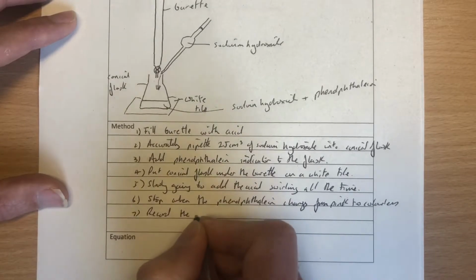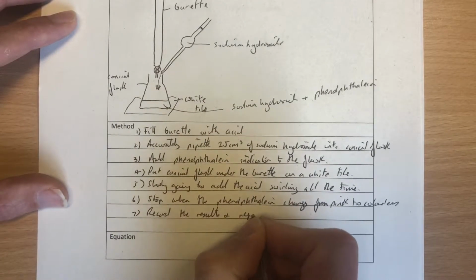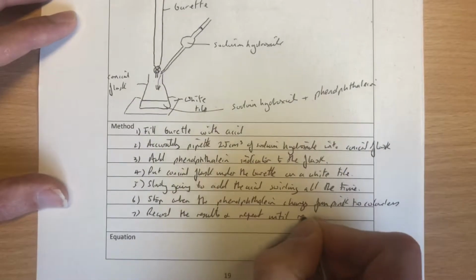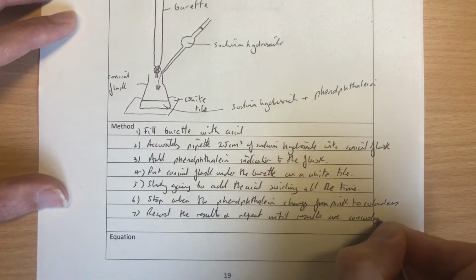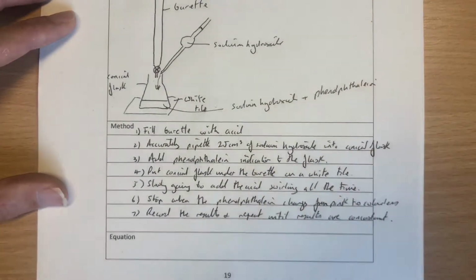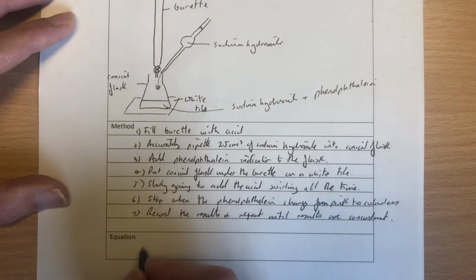So 7 is record the results and repeat until results are concordant, or similar in other words, and then we can average the results. And there is our 7 steps to doing a titration. The symbol equation for this we'll just quickly do down here.